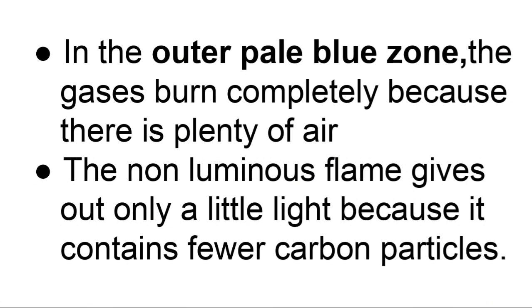So I would like you to watch a short video here on the two flames produced by the Bunsen burner.